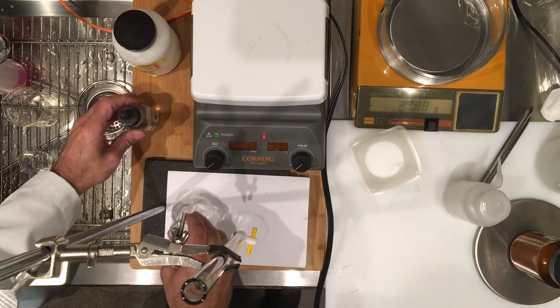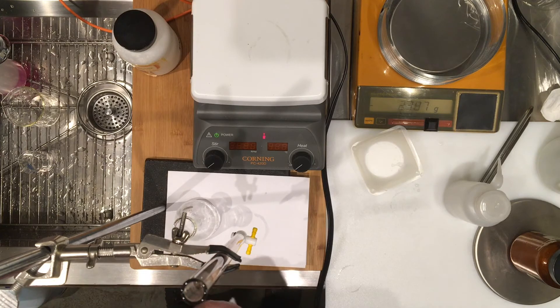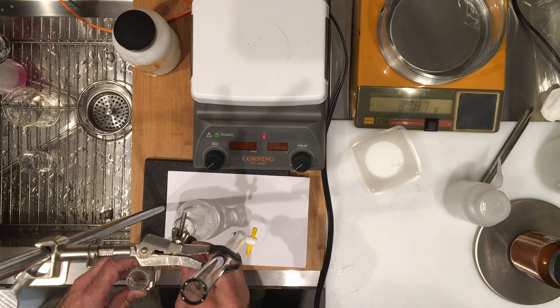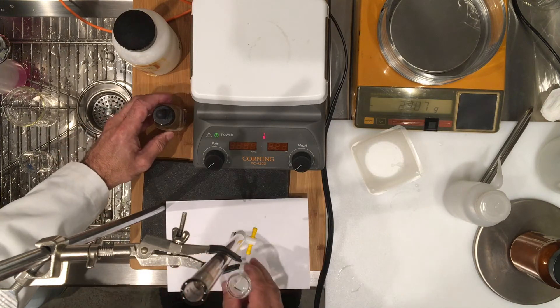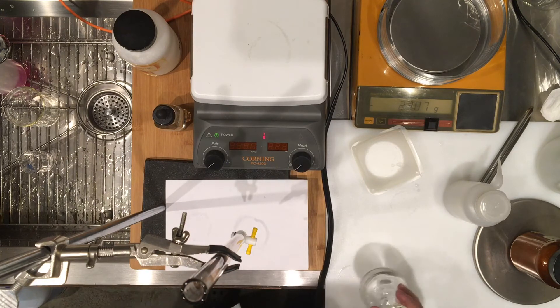I've already set my burette to zero milliliters with sodium hydroxide, and I'll add a few drops of the indicator. This time, if you notice, the mass is higher.